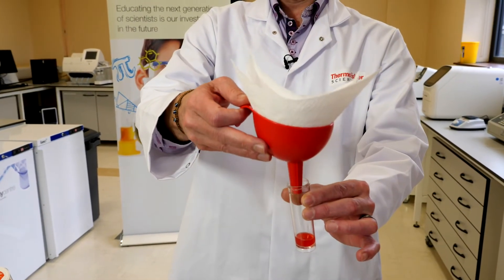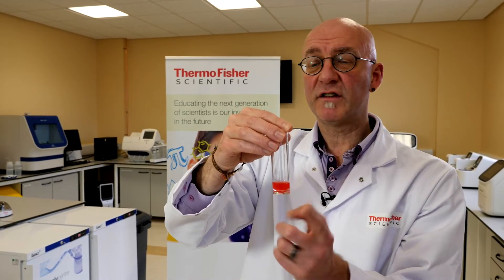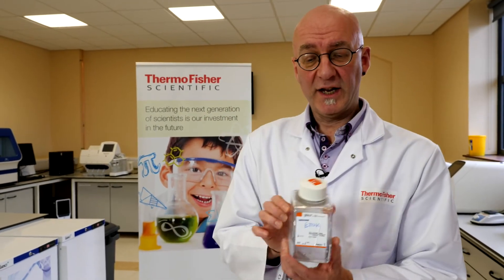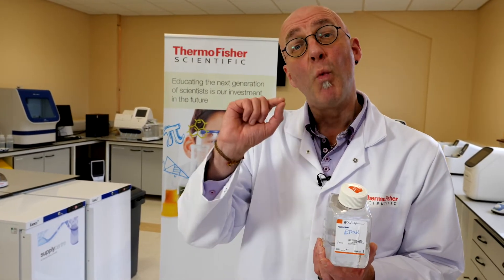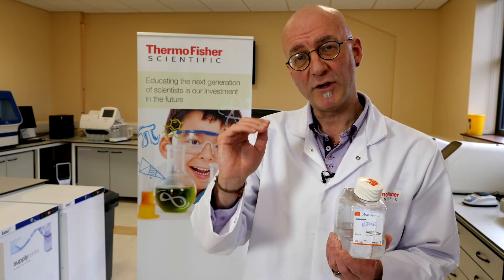We now have our tube with the strawberry solution filtered through. The debris is discarded. What we need to do now is get the DNA that's in solution to come out of solution — this DNA will stay in solution all day long and we can't see it. The way we do that is by using ice-cold ethanol. If we add ethanol and layer it on top of the strawberry extraction buffer — because ethanol is less dense than water — where the two phases meet, at what's called an interface, the DNA is going to try its level best to get away from the ethanol, fold itself up, and come out of solution.